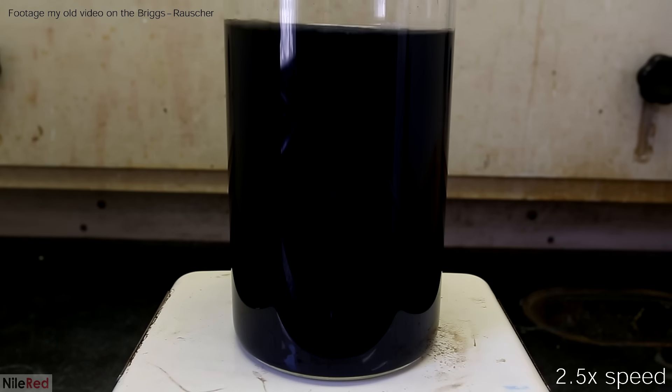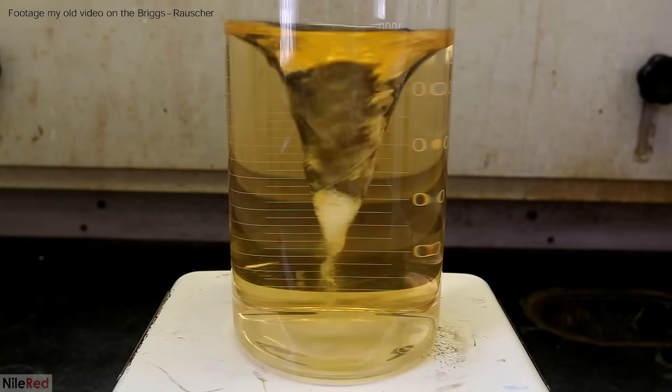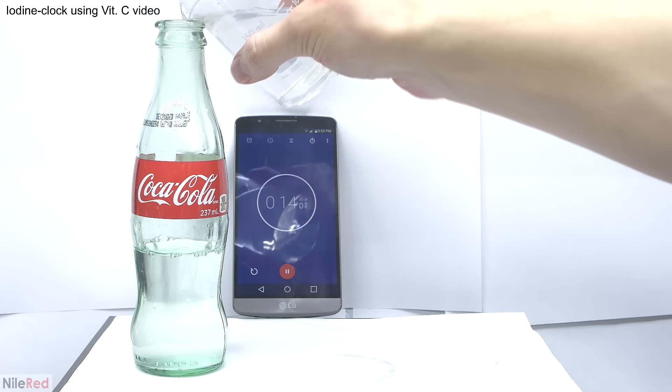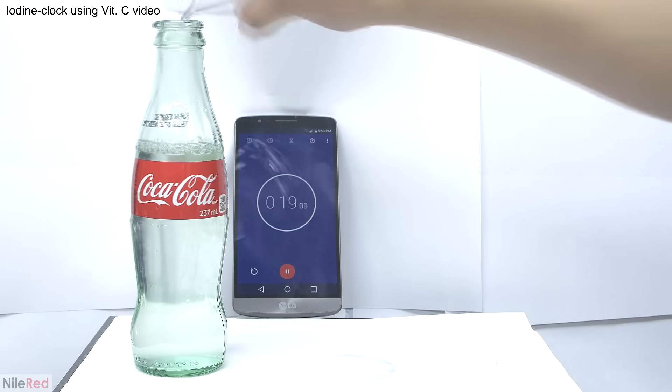The black color slowly fades and the solution momentarily reverts back to being colorless. It then starts to become yellow again and the cycle repeats itself several times. It's similar to an iodine clock reaction where a colorless solution quickly turns black.